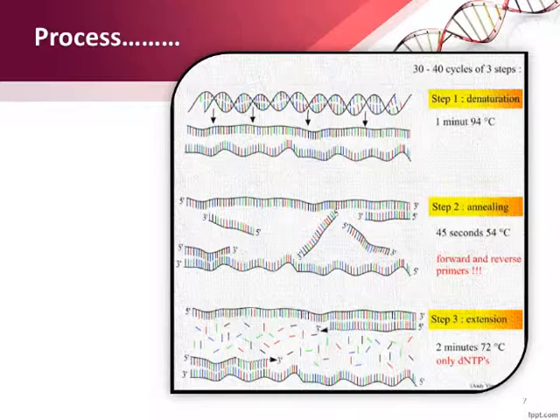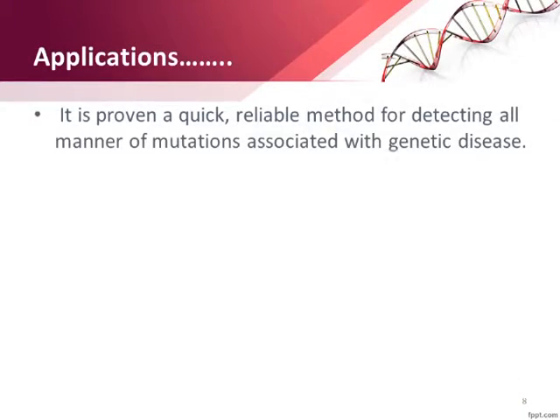End of the cycle. At the end of the first PCR cycle, there are now 2 new DNA strands identical to the original target. However, the DNA polymerase does not recognize the end of the target sequence. The newly formed strands have a beginning which is precisely defined at the 5' end of the primer.